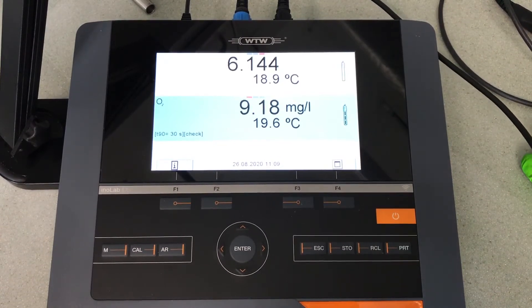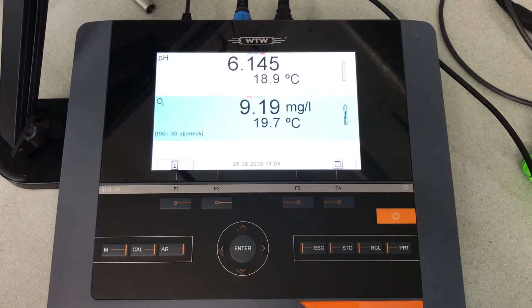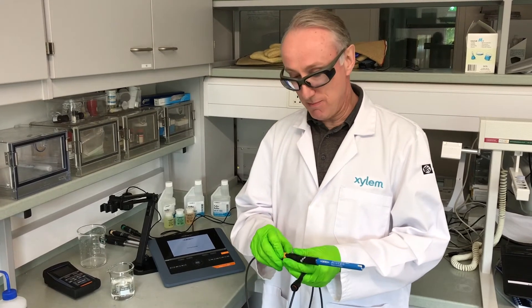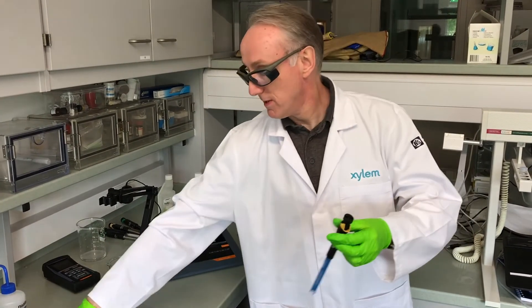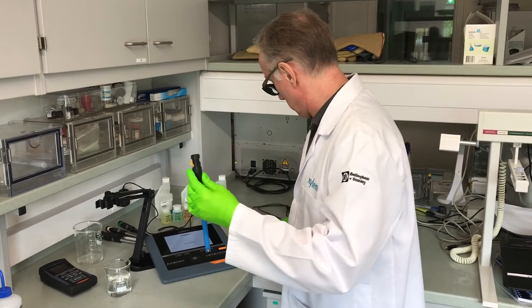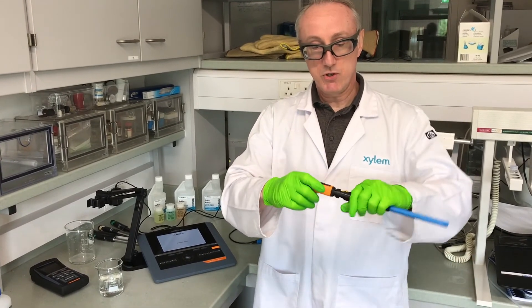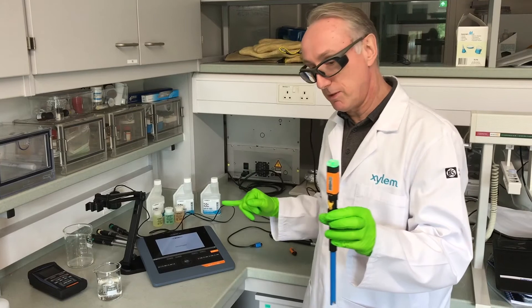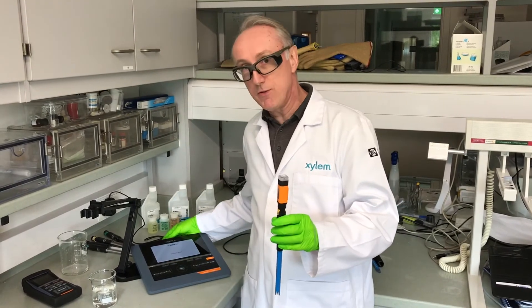So we've now connected two digital probes into the meter, and I'm now going to demonstrate the wireless aspect of this probe. We've demonstrated the use of the digital probe connected with the cable. Now I'm going to show you how to disconnect the cable — there's a little clip there and the cable pulls off, so we now have the probe on its own. We're going to connect it wirelessly. To do that, we need to take a wireless transmitter — it's this little device that connects in here and pushes in and locks into place. You can see the green light — it's now searching for the base unit, searching for the meter. You need to plug a little orange dongle into the back of any of the three ports.